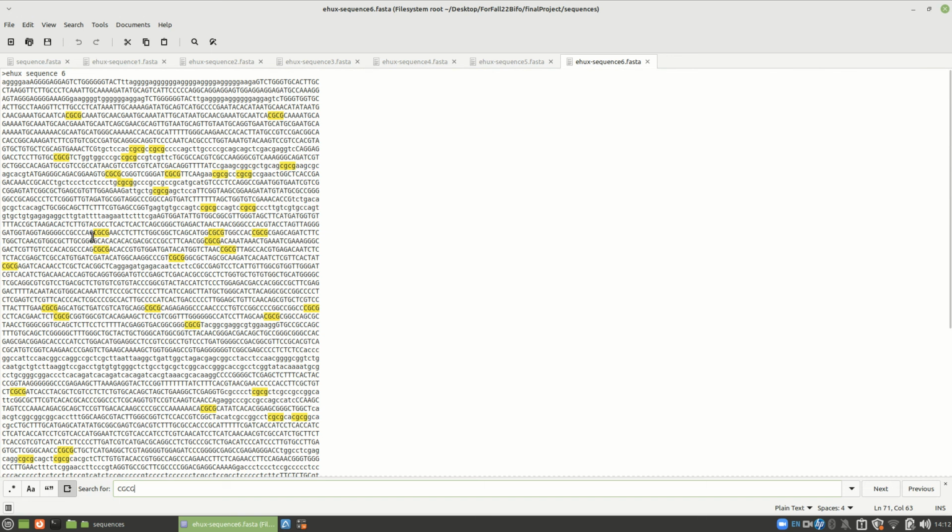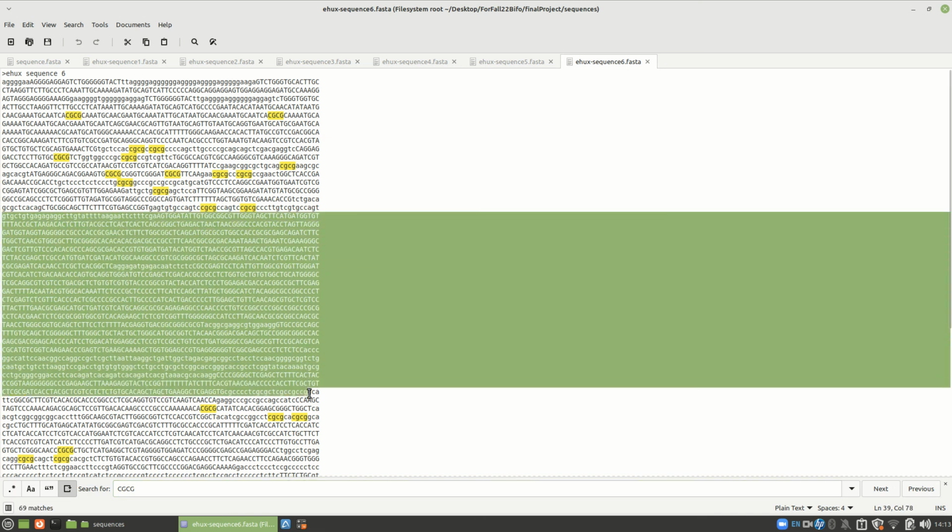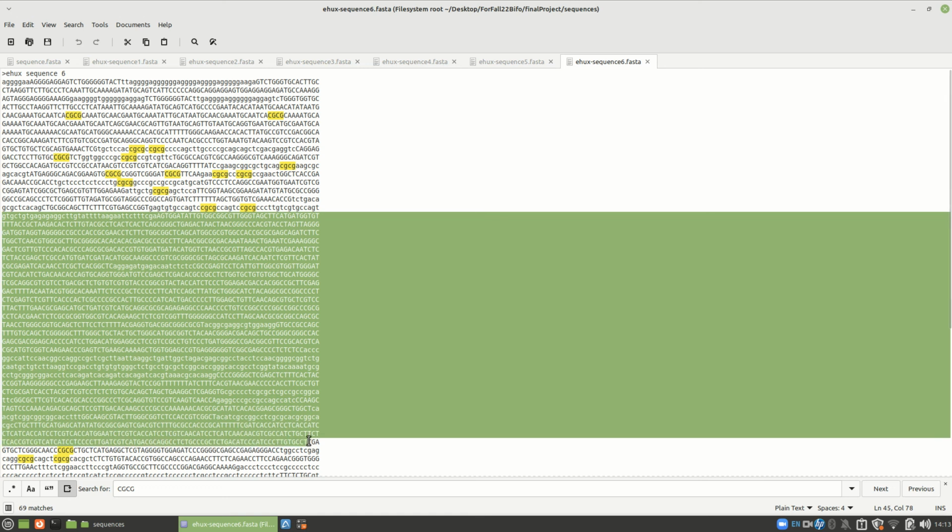So if you think there's a gene in here somewhere, our next part to help find where the coding region is is to take the piece that we think is the gene. Maybe I start in the middle of my CpG island and go down to maybe here. Take out this piece and we BLAST it against an algae that is well sequenced, or a couple of algae that are well sequenced, and we see if it matches any genes. If it has any sequence homology or similarity, we can work with it, and if you find that, then you can move forward. So that'll be our next thing to do.